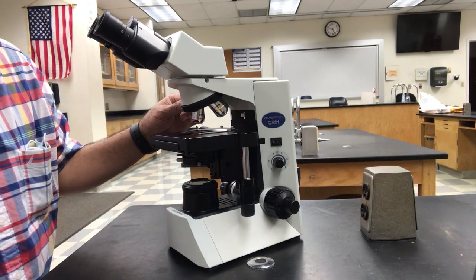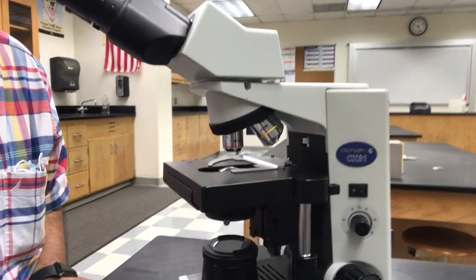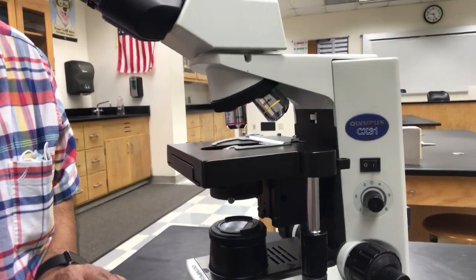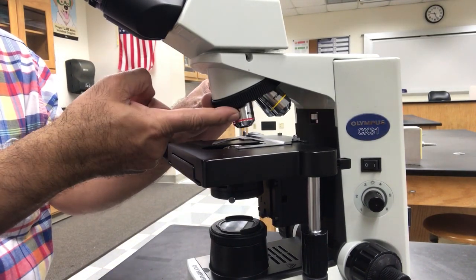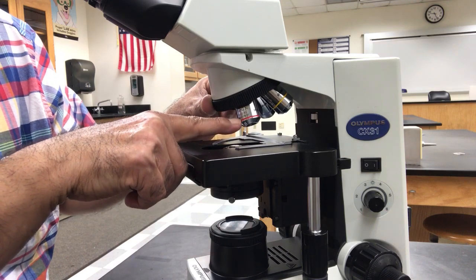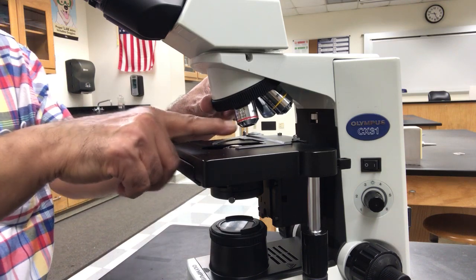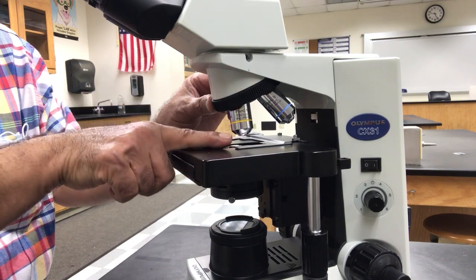The shortest one is called the scanning objective lens. It has a red ribbon around. Scanning has 4x written on it. That means it can magnify 4 times. The next one is the yellow ribbon one.